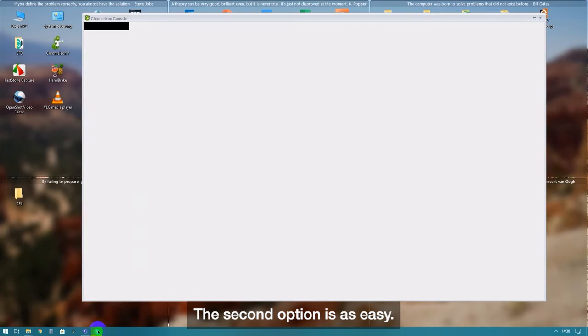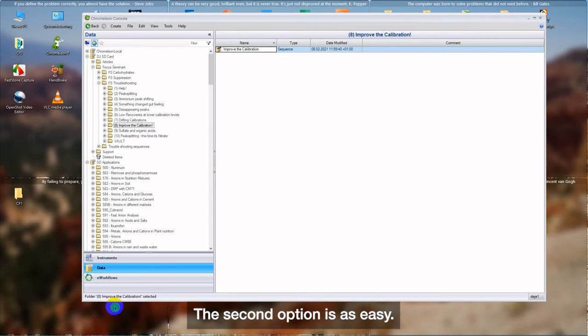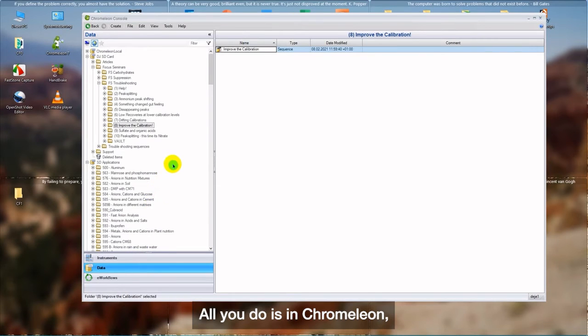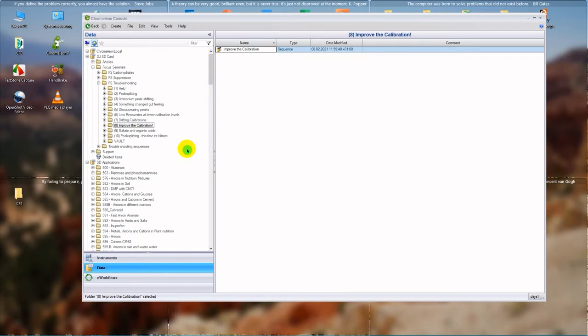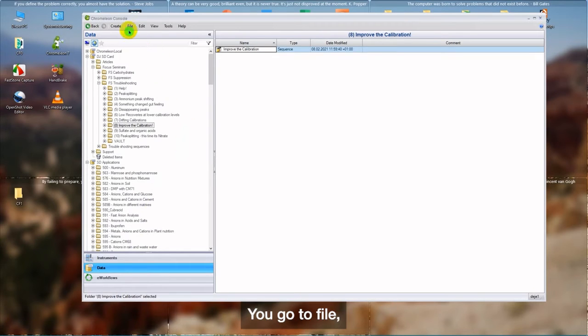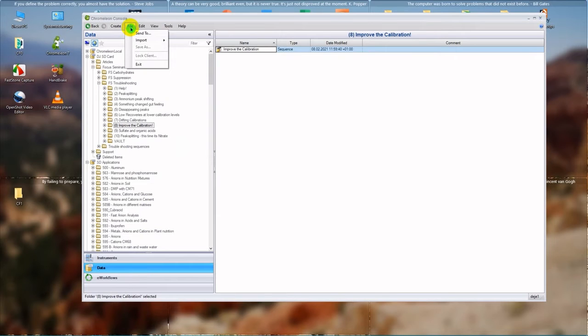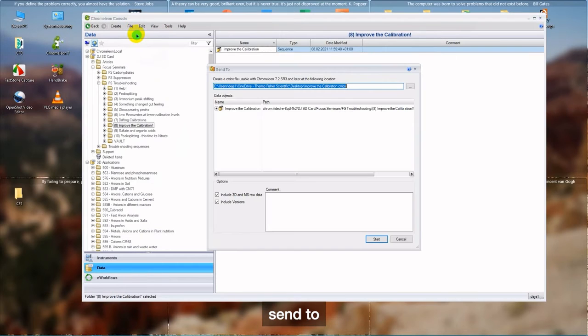All you do is, in Chromeleon, in the console, you go to File, Send To.